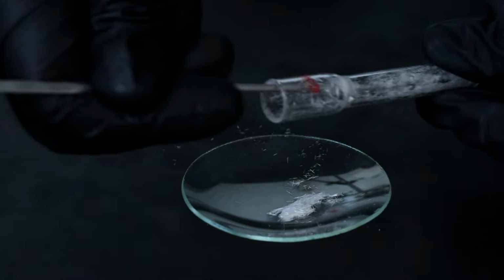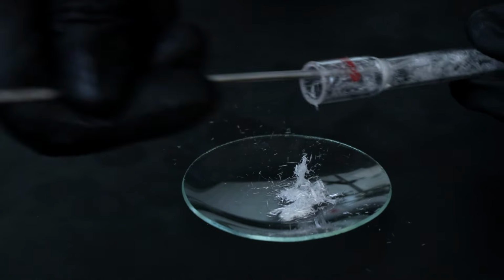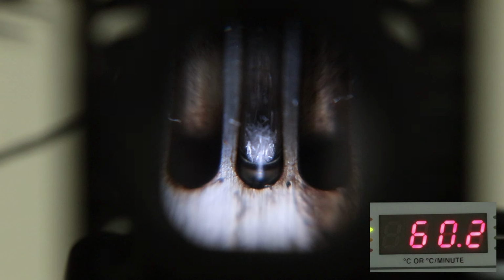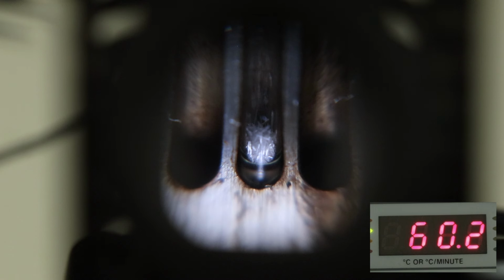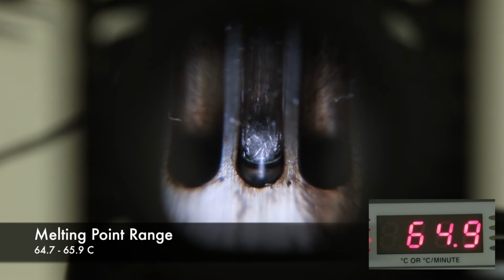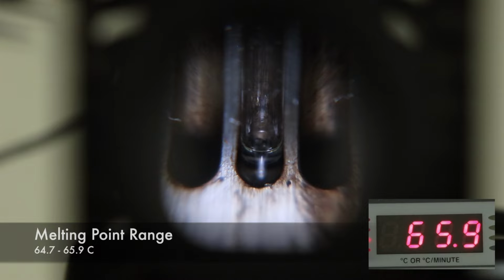Now I can remove the pure crystals and see where this alcohol's melting point is. I initially put it in right around 60 degrees Celsius since I already know that it's going to be one of the four lower melting points. And nothing happened, so I'm going to slowly start raising the temperature to see exactly where this melts. And I started seeing it melt around 64.7 degrees Celsius, and it looks like it completely finished around 65.9 degrees Celsius.